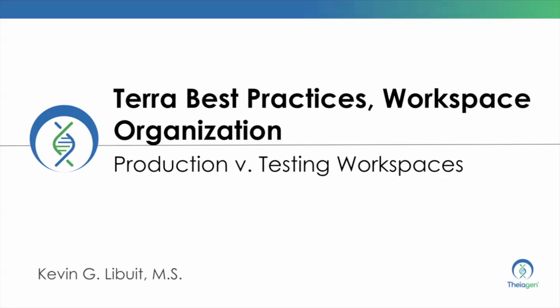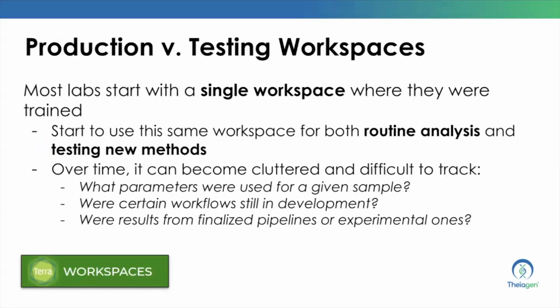of the platform. In general, we see that many labs start with one Terra workspace, and it's often the same workspace they used for an initial training. And we see labs use this single workspace for both routine analysis and testing new workflows. But as this workspace grows, this can create clutter, confusion, and challenges in reproducibility.